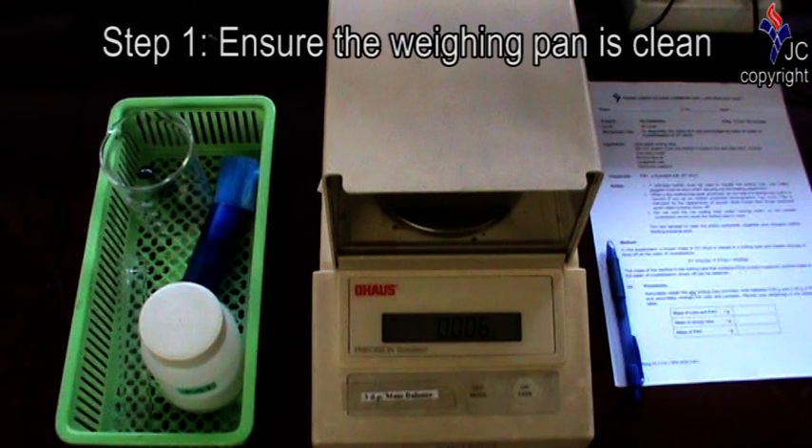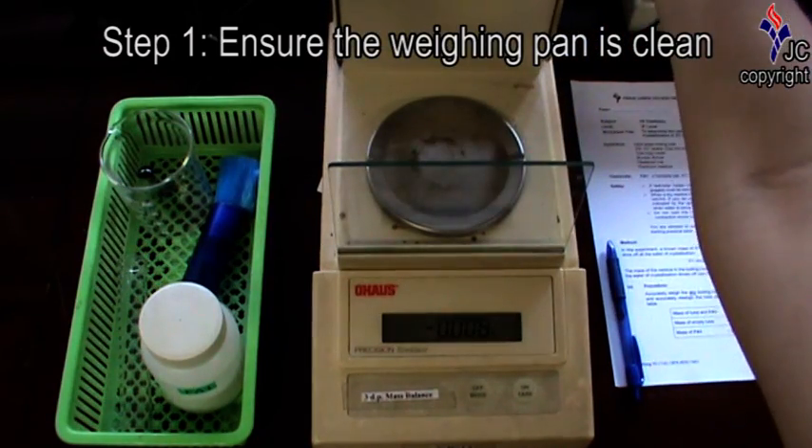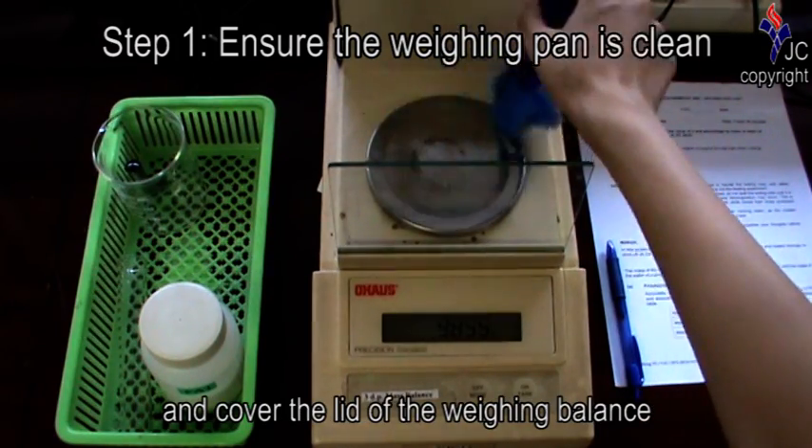Before you begin, ensure that the weighing pan is clean. Use a brush to sweep the pan if it is not clean, and close the lid of the weighing balance.